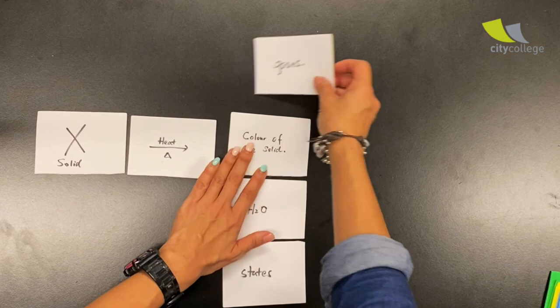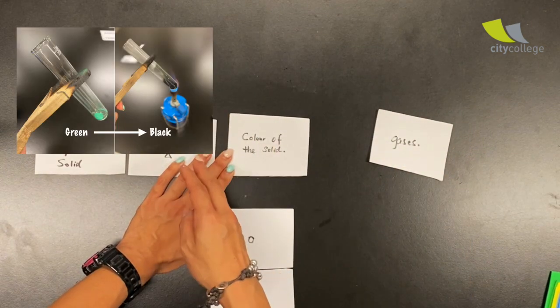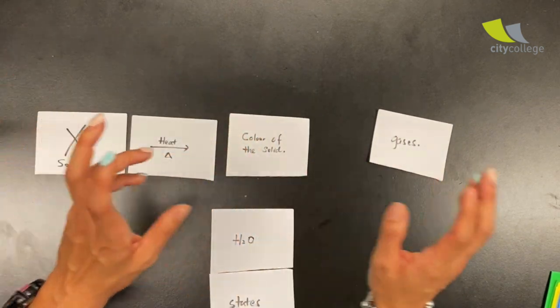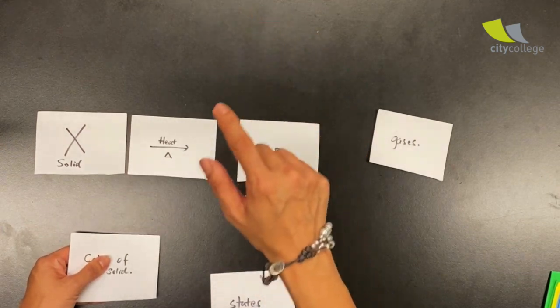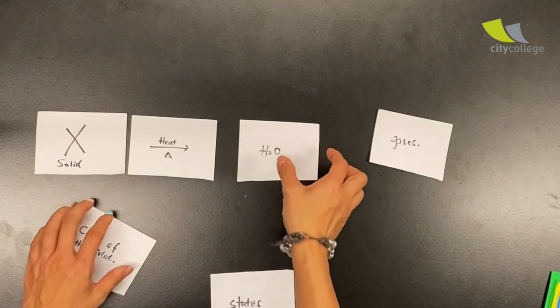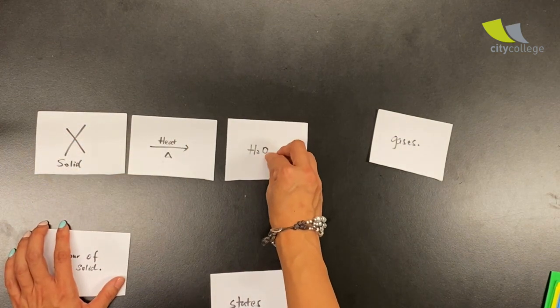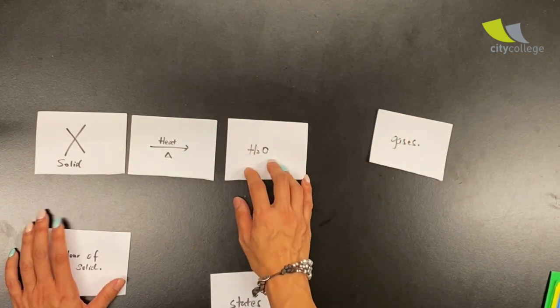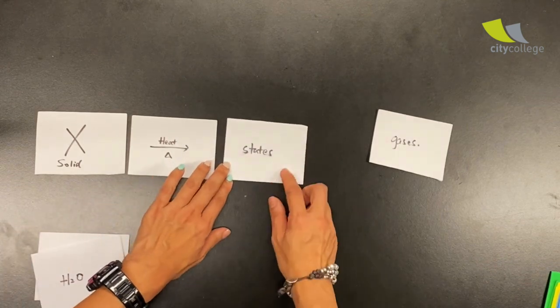When you're heating and observing the solid, if the solid color changes, for example from green to black, you need to write down before heating is green, after heating it turns to black. For water, you might see from the side of the test tube whether there will be water droplets form. If there's water droplet form, you can say that water is evolved, is produced from the sides of the test tube.